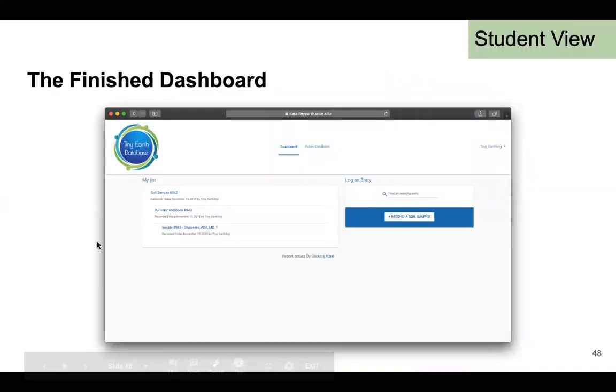So this is how it works, and you'll see the four-code number. It's currently 4 codes. Obviously, once we get over 10,000 isolates in the database, these will increase in number. But that's the ID, the unique ID that we're talking about being given to everything.